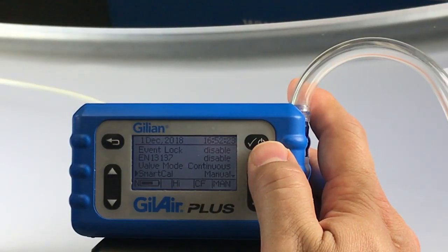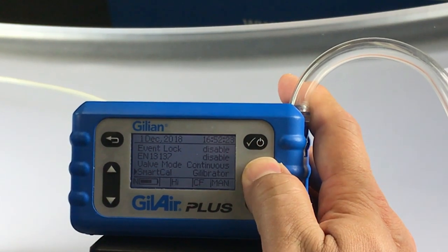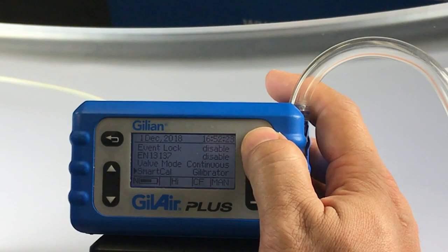On the GillAirPlus, from the setup menu, select the Gillibrator mode and hit enter to confirm.